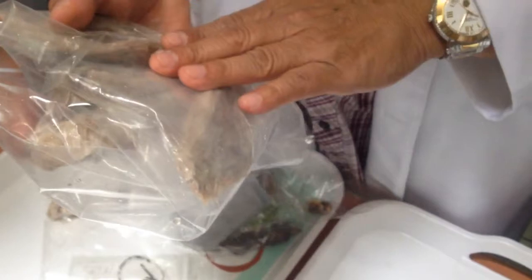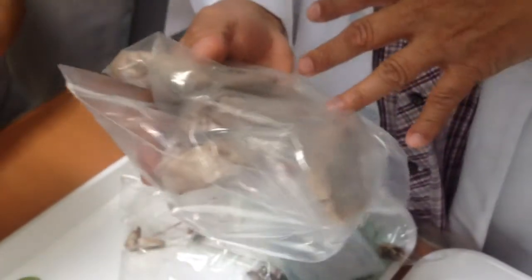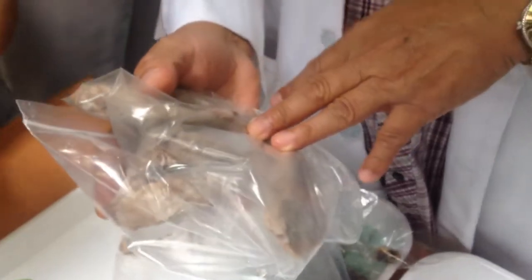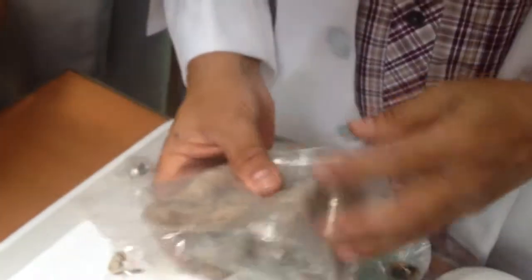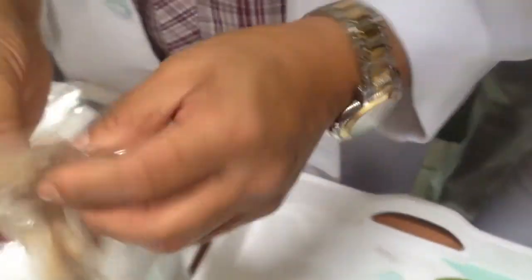I forgot to mention that this will behave as a sarcoma. And so the usual spread is vascular, hematogenous. And the management is simple mastectomy only. Do not include the lymph nodes. Okay. And the last one is your mucinous carcinoma.